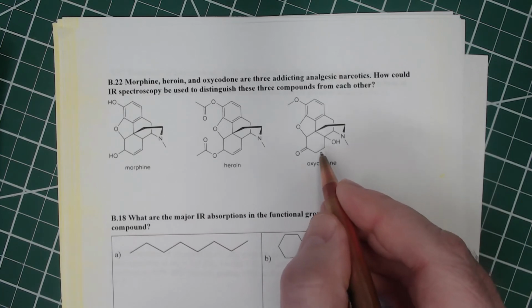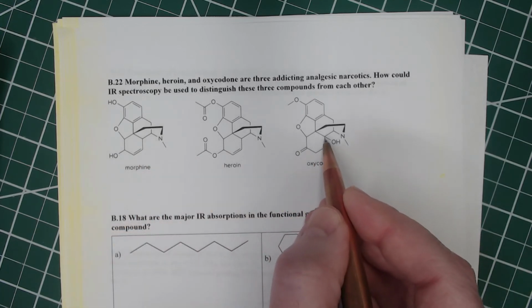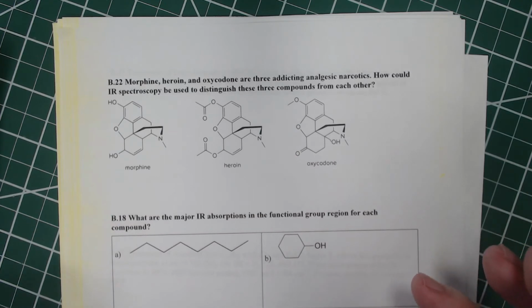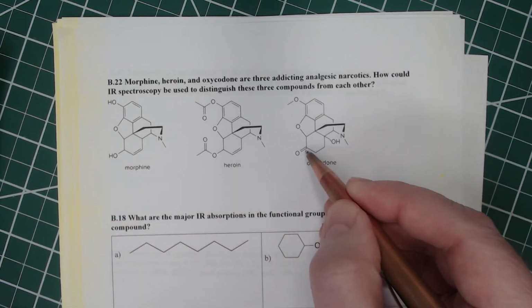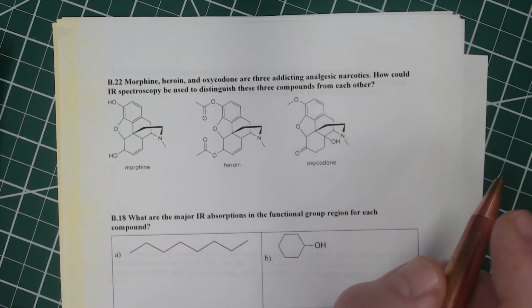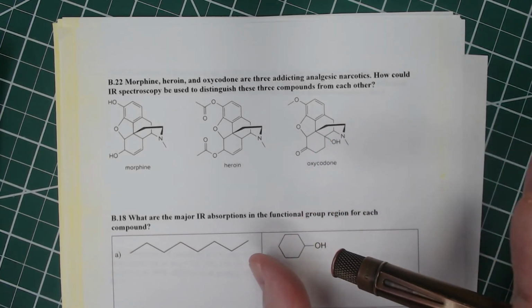And then oxycodone is a derivative. You'll see that a double bond here is changed, and here we've got an OH that is on this bridgehead. So there's a couple of little subtle differences. This, instead of an OH, has an ether linkage, and here, instead of having an OH, it's got a carbonyl. So there are some things that are different. We want to be able to distinguish these using just the IR. So I'm not going to list all the things that are the same because there's a lot of similarities.